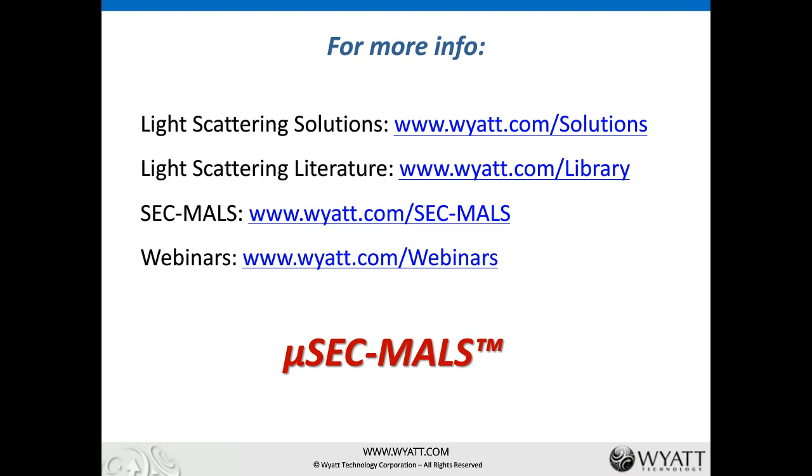What is the lowest difference limit in molecular weight for conjugated samples versus unconjugated samples that can be successfully characterized using DAWN, Helios and microDAWN? Good question. So the conjugate analysis. Let's talk about the molar mass determination of MALS. MALS and mass spec are different. MALS measures the molar mass from the Rayleigh ratio, the light scattering intensity. Its precision can be really good, within 1%. Its accuracy, depending on the system, could be about 3 to 5%. So that's a rule of thumb.